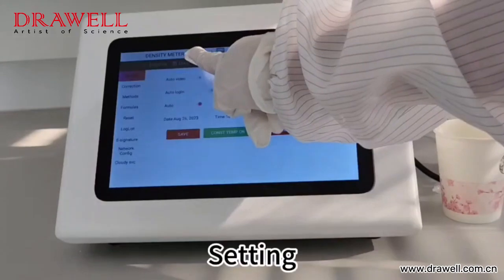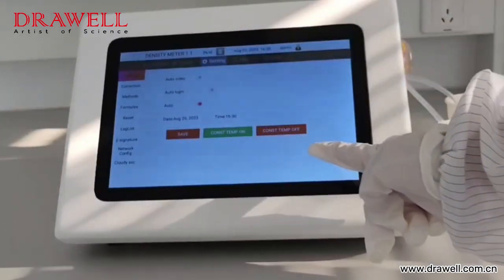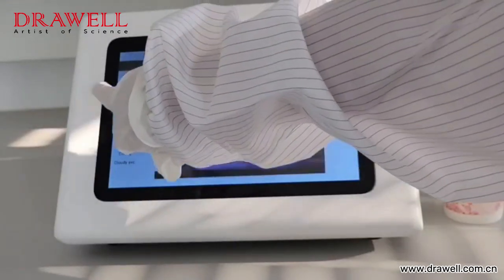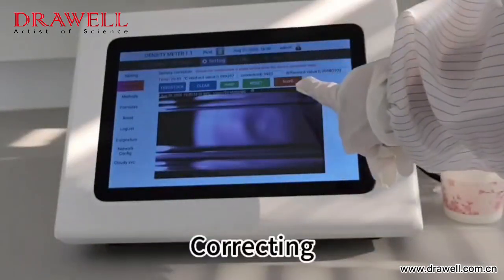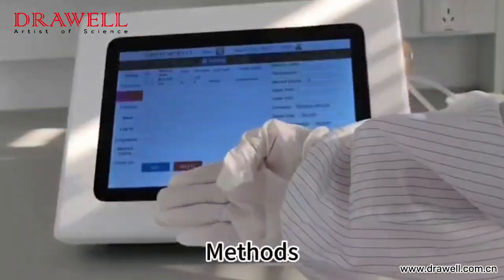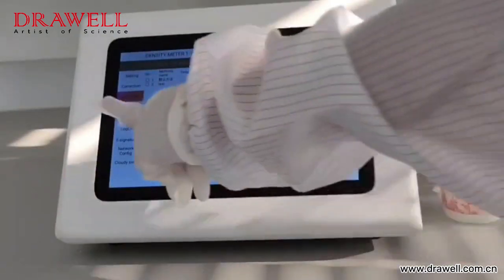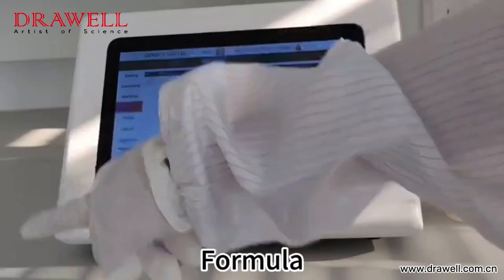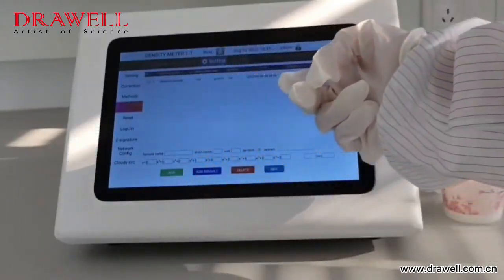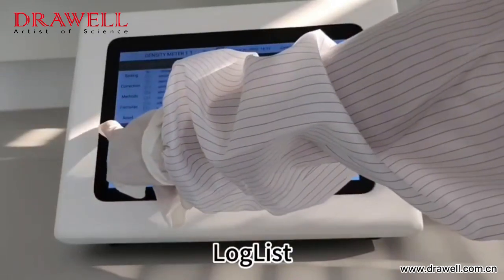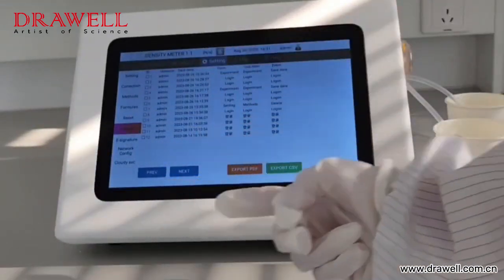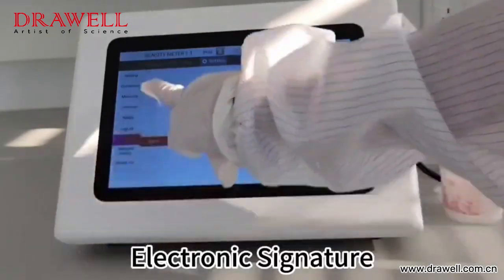Setting. Correcting. Methods. Formula. Log list. Electronic signature.